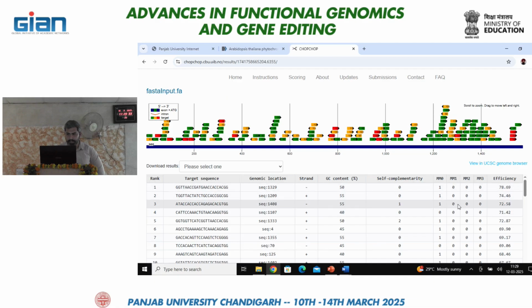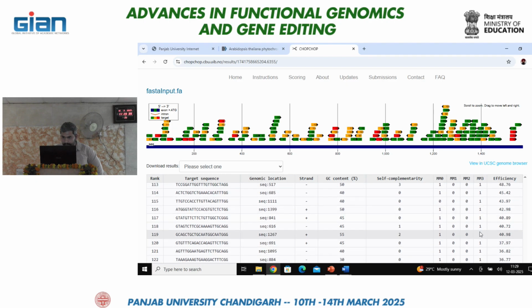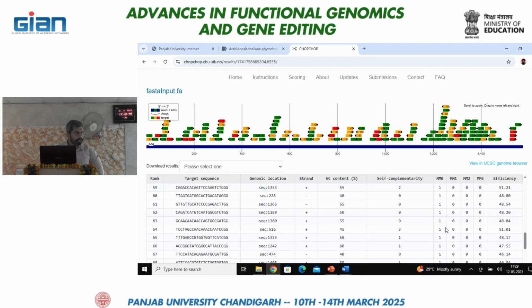And with mismatch 1, like here you can see that this target with 3 mismatches binds in one position somewhere else, and all these results are interpreted differently in different software or tools. So in this list, with this example, according to me the fourth one, with rank 4, is the best one, because with mm0 it doesn't bind somewhere else, it's 0 in all 4 of these, mm1, 2, 3 and this.